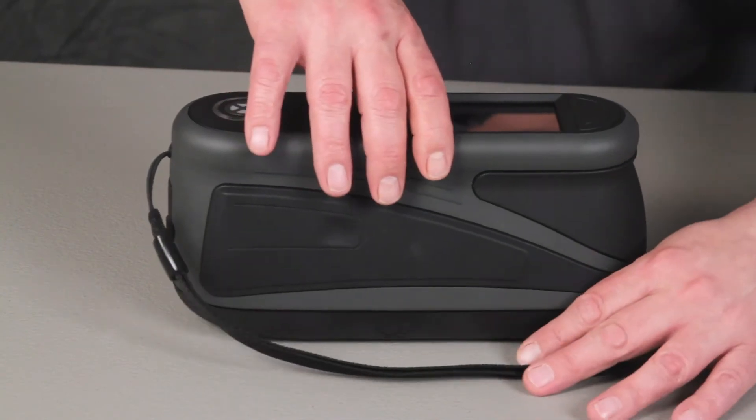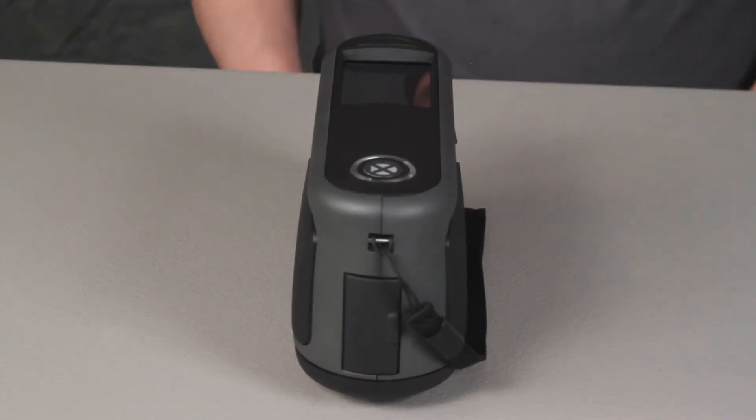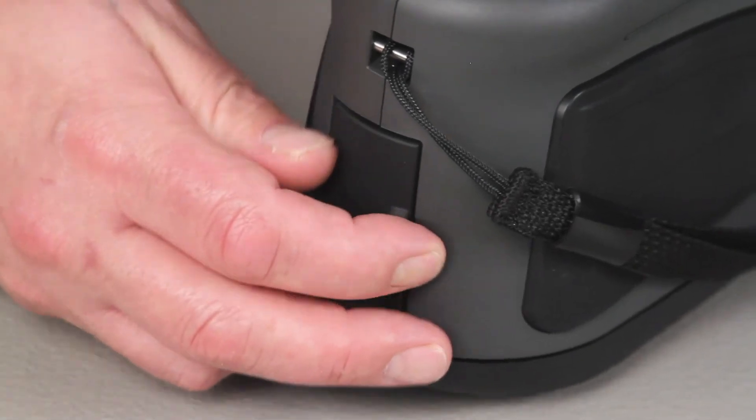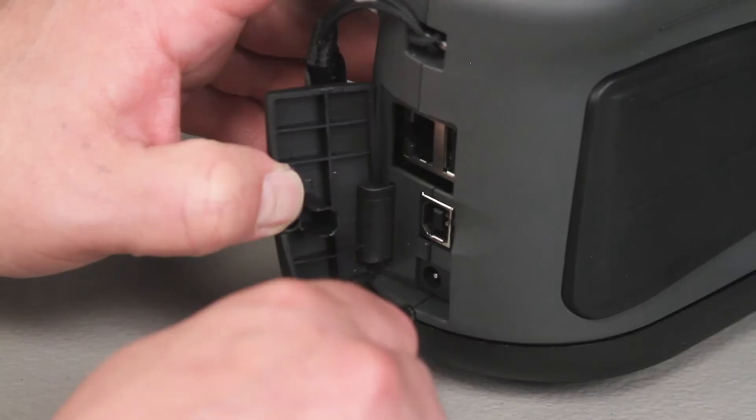The back of the instrument attaches to the safety wrist strap. This should not be used to carry the instrument. Opening the back cover will reveal all of the available connection ports including USB and AC power adapter.